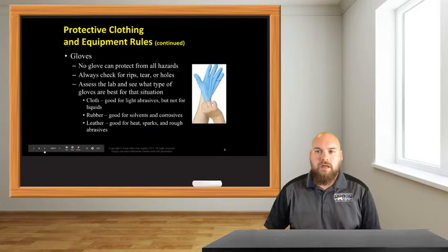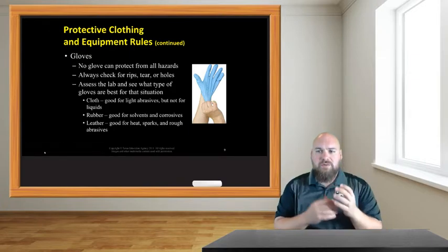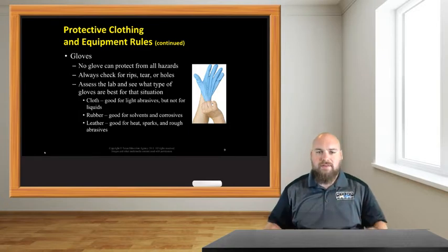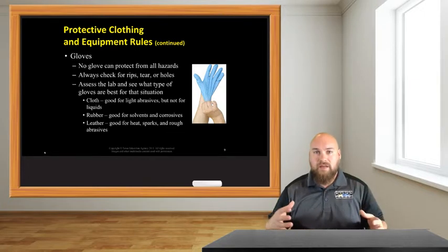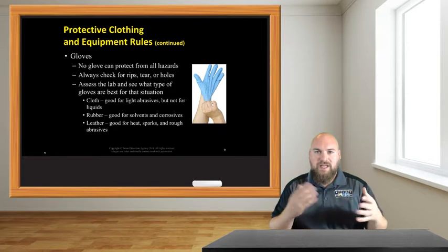Remember that. Okay, gloves. We're rarely going to need gloves in our class, but this kind of helps give an extra layer of protection from chemicals like acids and bases and things of that nature. But we also have different kinds of gloves depending on what we are going to be doing. So we wear cloth gloves if we're going to be doing something that's dry, like working in the garden. You usually don't work with a lot of wet stuff when you're just digging in the dirt.